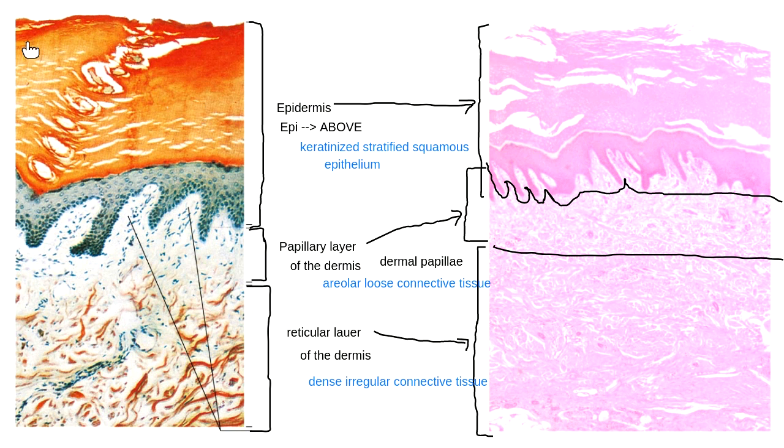And we talked about, I think it was last week when we did epithelial tissue, how when you're filled with keratin, you die. So all we're seeing in these cells out here is they're completely filled with keratin and they're completely dead. When they made this particular slide of that tissue, that keratin got stained orange. So these are the outermost parts of the keratinized stratified squamous epithelium where there's a bunch of keratin.